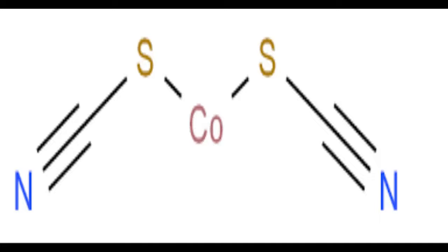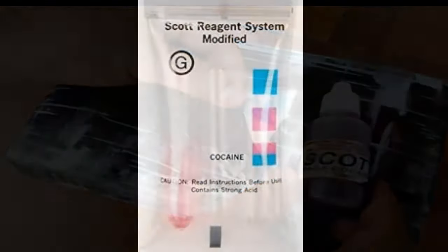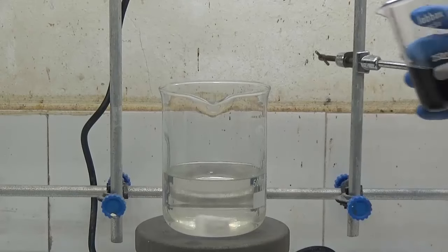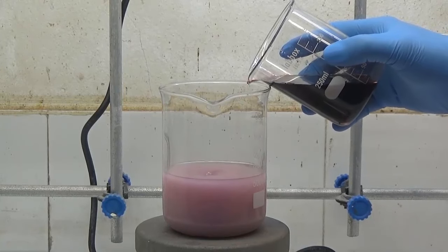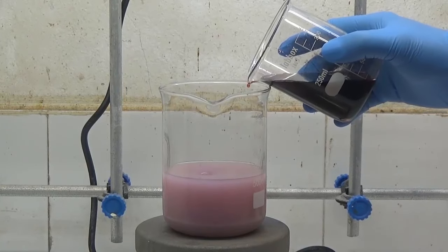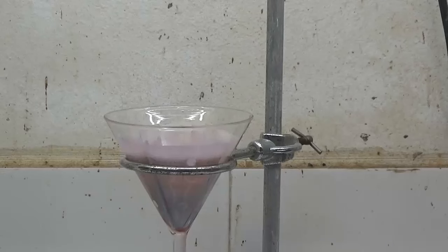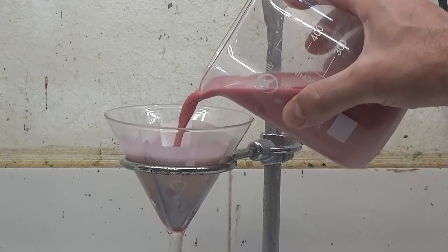In this video, let's see how to obtain cobalt thiocyanate. Cobalt thiocyanate in acid medium is used in the Scott test, a widely used test for early alkaloid detection. To obtain cobalt thiocyanate, cobalt sulfate and barium thiocyanate are reacted in the cold. The result is a barium sulfate precipitate that is separated by filtration, while the cobalt thiocyanate remains soluble.